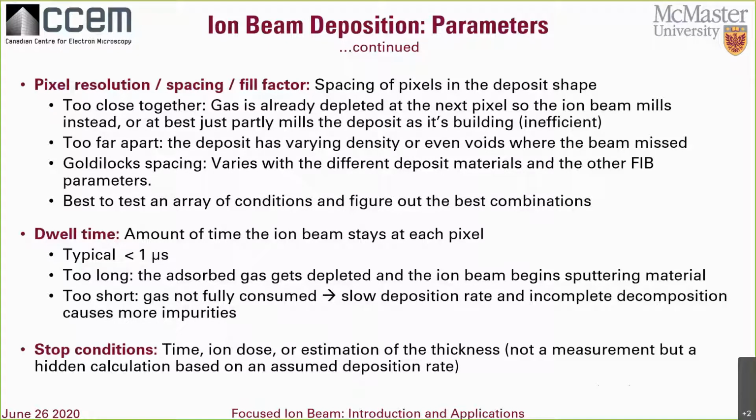But really, it's a problem to try to mill at too high of an aspect ratio, because there's that issue of redeposition closing off the bottom of the pit, and then you just can't mill any farther. What you end up having is redeposited material landing back in nearly the same place from where it started, and you just keep milling that over and over and accomplish nothing. So eventually the bottom will come to a point and then stop.